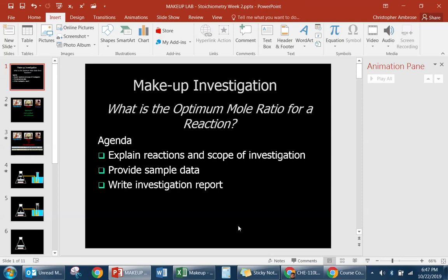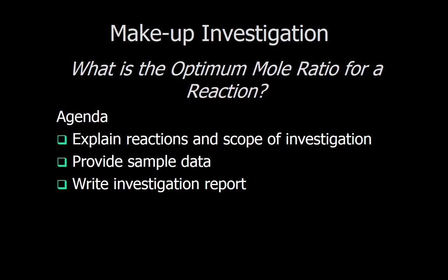This is the makeup investigation for the lab that we missed the past Thursday. The guiding question for it is, what is the optimum mole ratio for a reaction? So what I'll be doing here is explaining how the reactions worked and the purpose and the scope of the investigation. After that, there will be an associated Excel sheet that will provide you with sample data, and then based on that, you can write the investigation report.